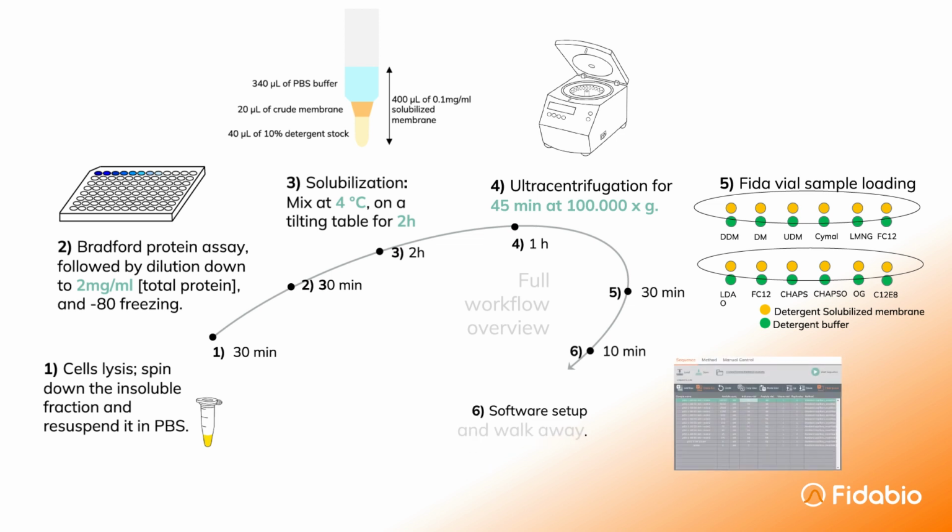The last step is to set up the FIDA sequence and walk away. If you test 12 different detergents, in 3 hours your data will be ready.